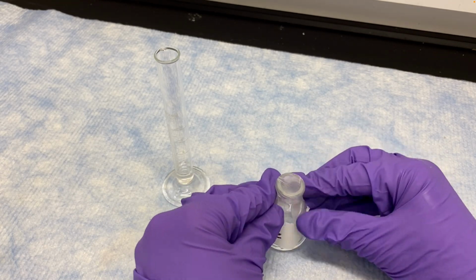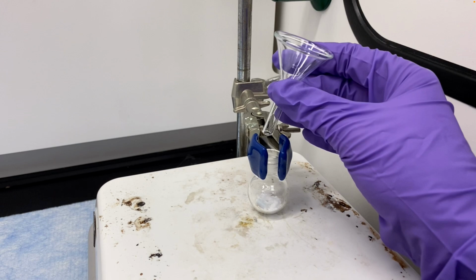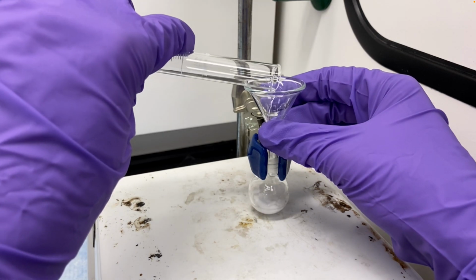When you're done using a solvent, always cover it up, especially in the organic lab. It'll evaporate really fast, and so you won't have it available later in the experiment if you don't do that. Also, we're doing this underneath a fume hood, which is essentially a big box with a vacuum cleaner on top that's constantly sucking up air. As it sucks up the air, it makes things evaporate more quickly also. Notice the stem of this funnel, which is used for a liquid, the short stem funnel, is thinner than the one we used to add the solid to the reaction flask.